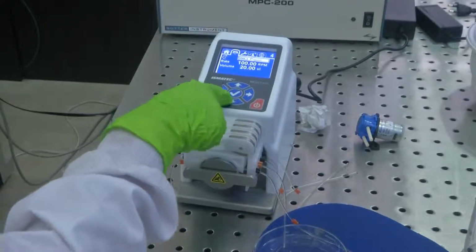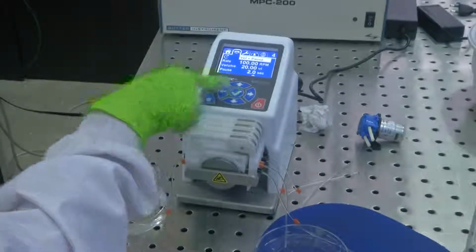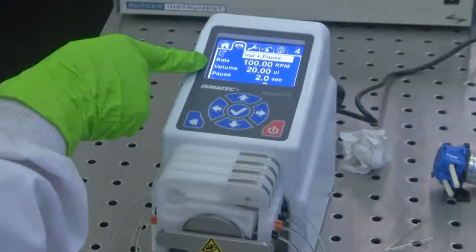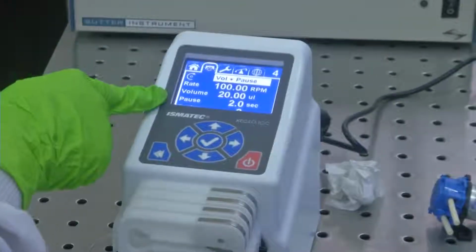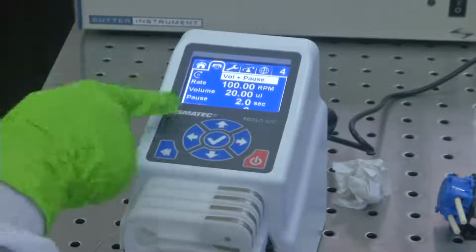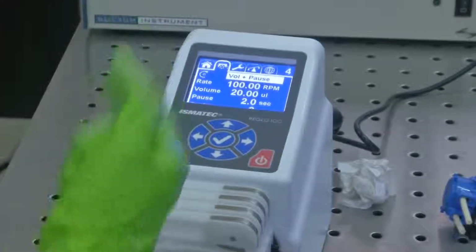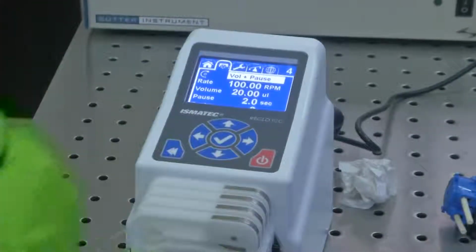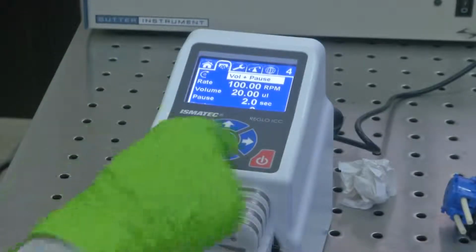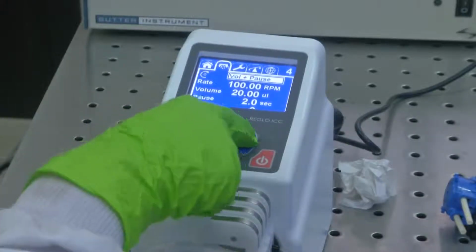So, this is the time and this is volume plus pause. So, when you get into this option, you could control the rate at which it is rotating, you could control the amount of volume, you could pause it. So there is 20 microliter, every time it flows through the time, there is a pause of 2 seconds, and then you can set the number of cycles. So, like we said, the flow repeats. So, you could set the repetition rate. So, this is your cycle which can be set.